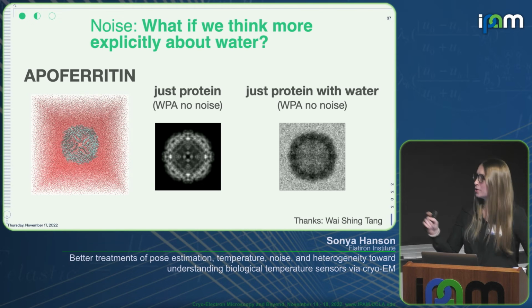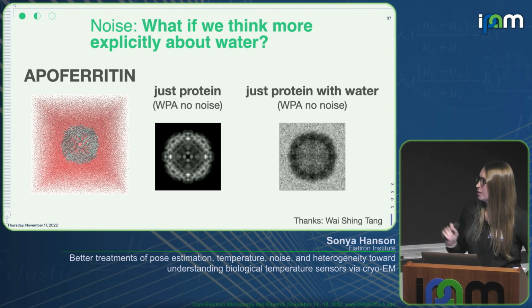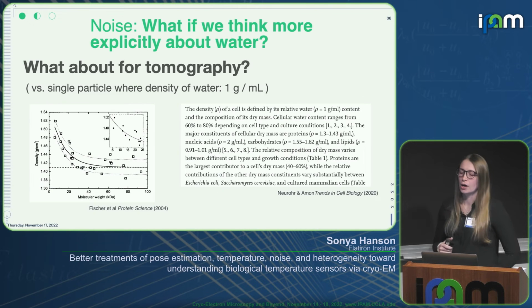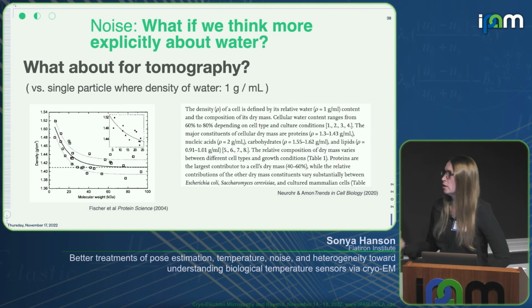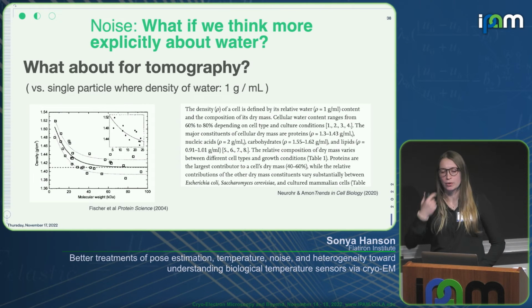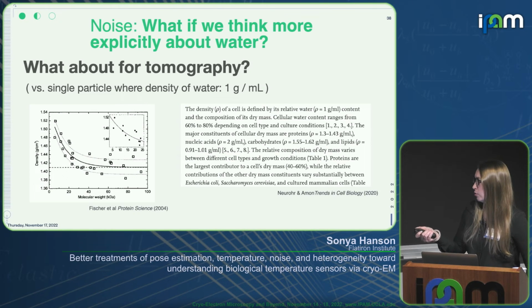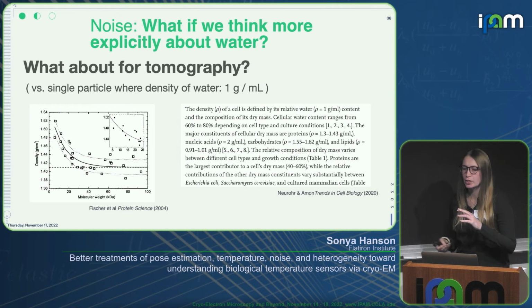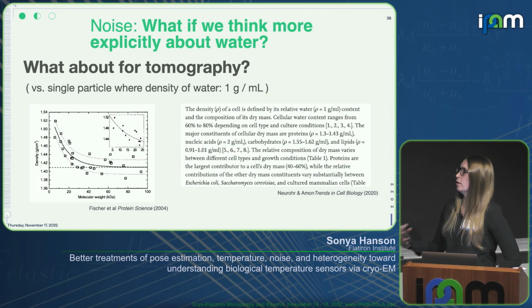Of course, there are all sorts of reasons to not care about this, but I think it's a nice way to think about how MD simulations can help us understand better models for noise, or explicit atomistic representations of water, or even, in the case of tomography, other proteins that we're trying to consider as noise but may not actually be when we're generating images.